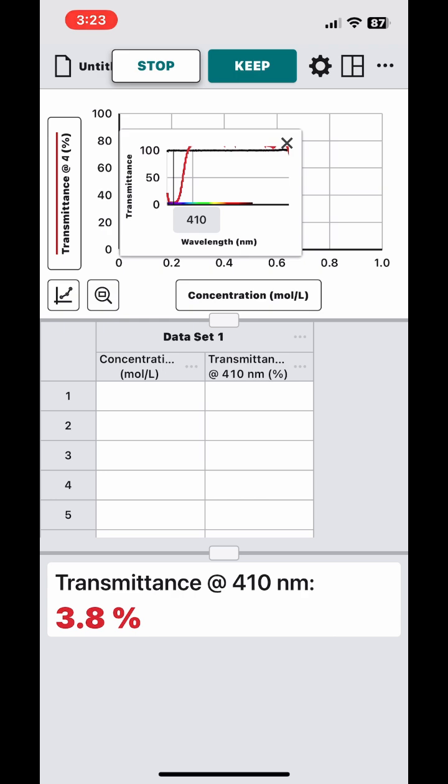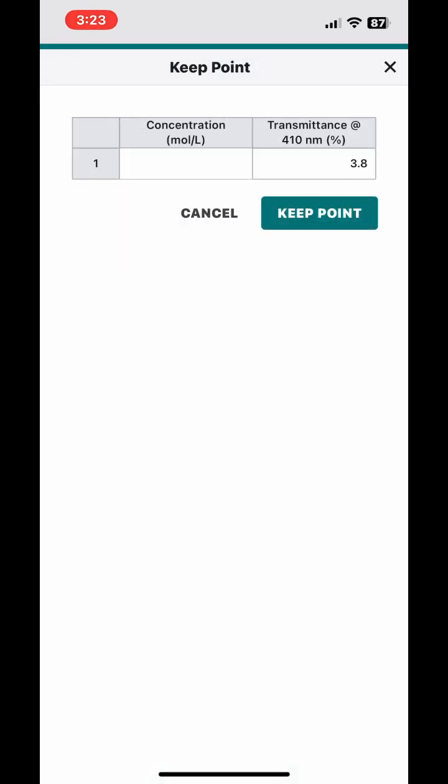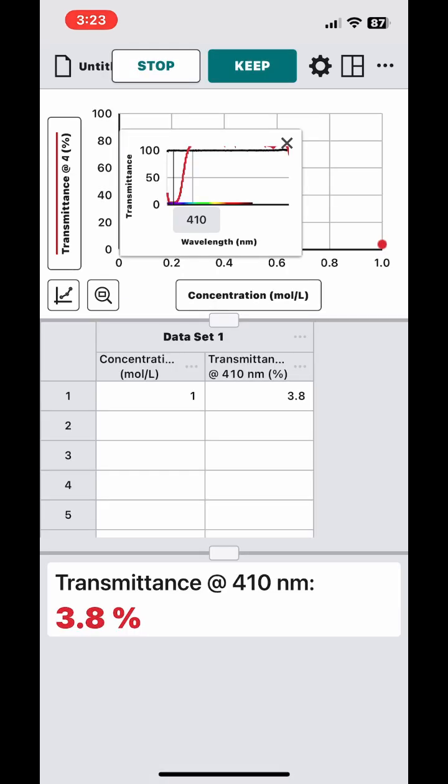I'll also be reviewing the transmittance setting of this app, and it's very similar. I'll just be going through measuring the transmittance of the 5 standards and then the experimental sample. And it should be noted that I'm going to use these to graph and make the standard curve so then I can estimate the concentration of the experimental samples.